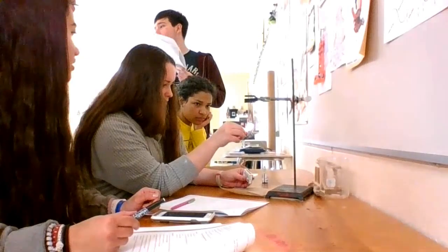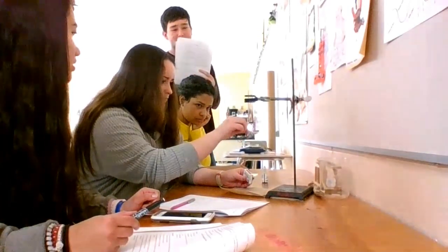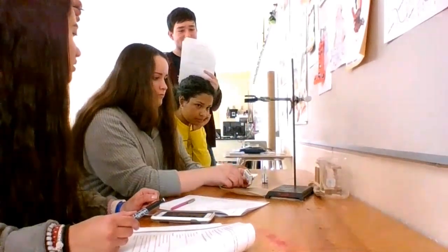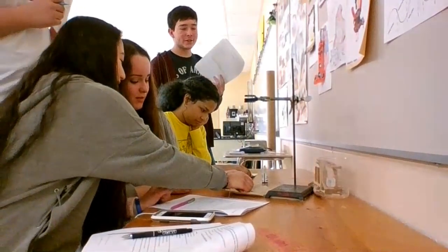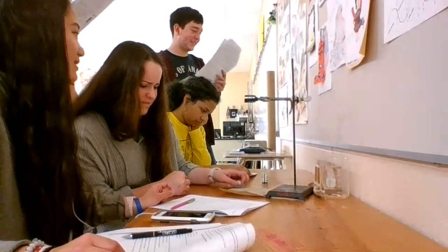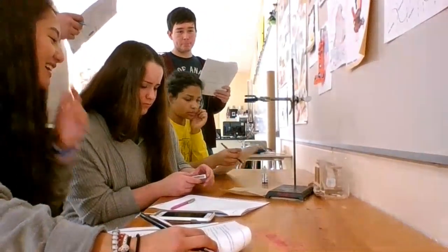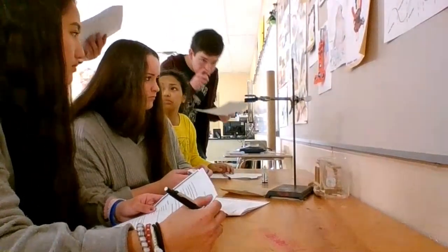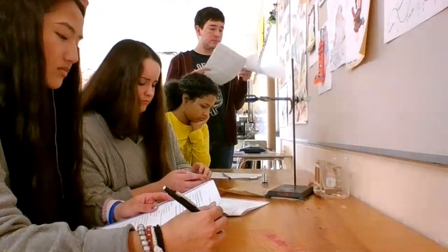Don't burn the test tube. Just get the smoke. Okay, it smells like s'mores. So now what? It turned yellow. All right, so you see that? It turned yellow? And yellow indicates the presence of the acid.